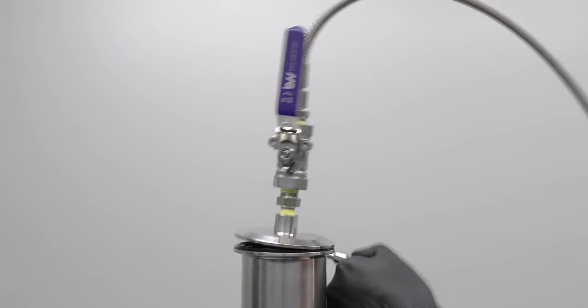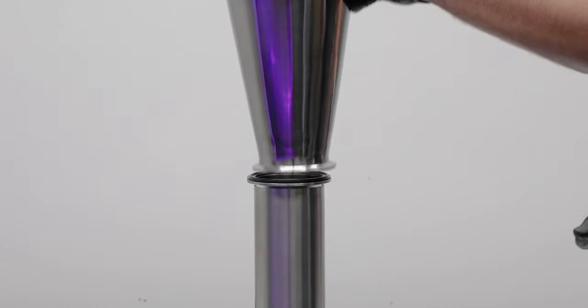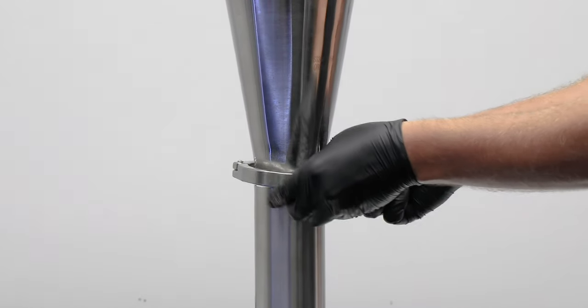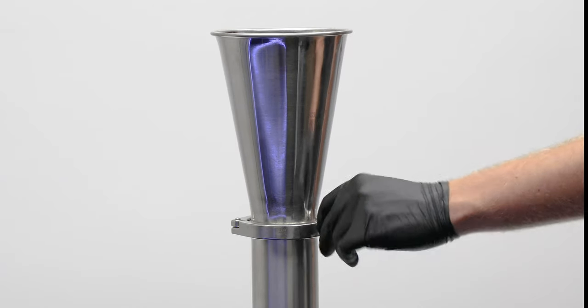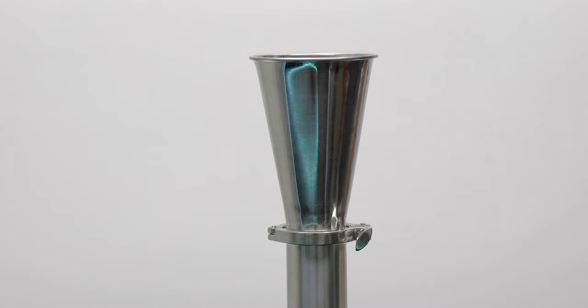Take off the top cap after doing a pressure test on the system. Pack material using a hopper like shown here. Add one pound of material into the column and press down with the packing rod.